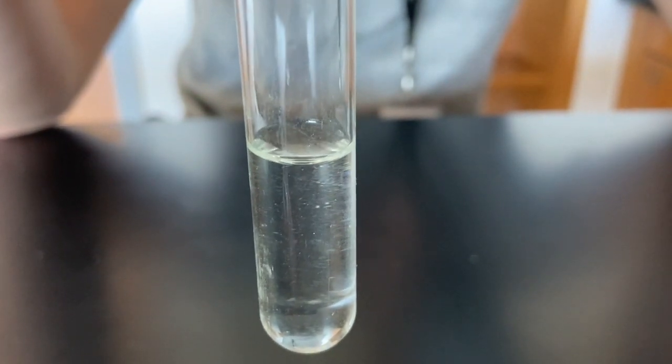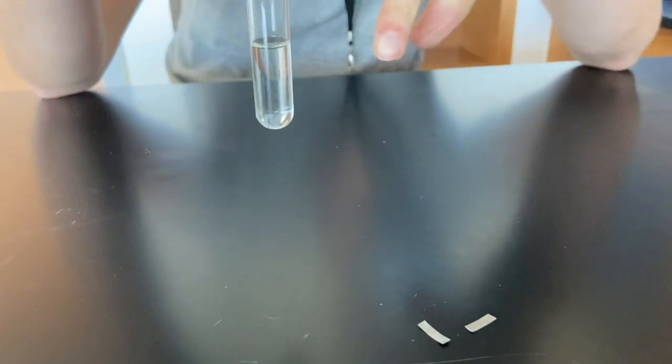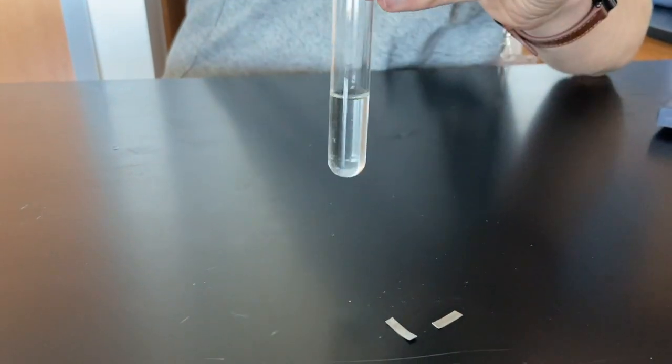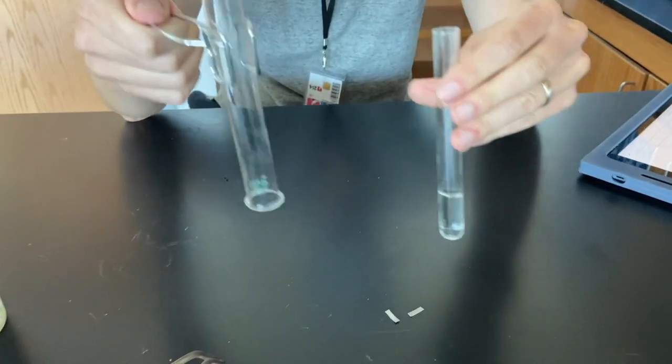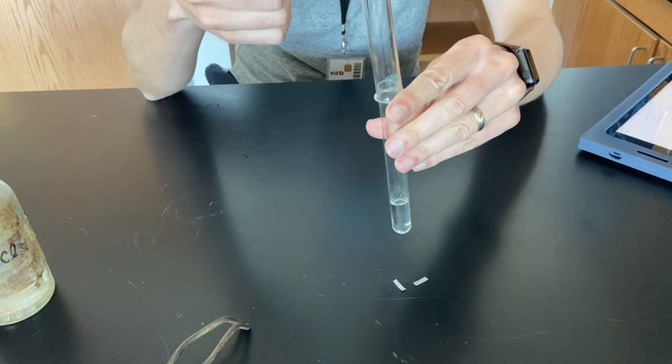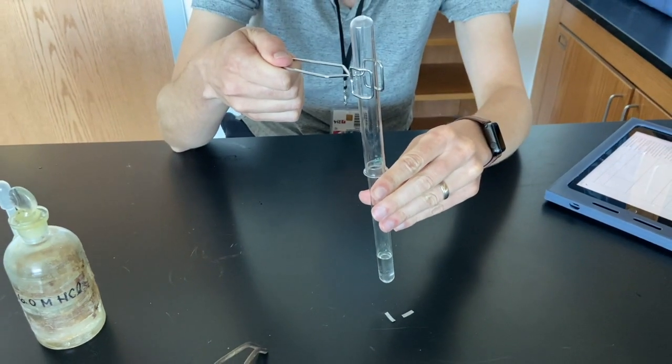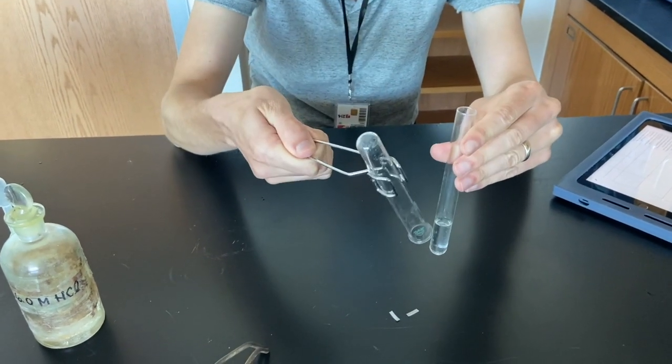Now what's going to happen is I'm going to put the magnesium ribbon, the two pieces, into the test tube. And I'm going to take a second test tube and put it over the top so I can collect the gas that's going to be emitted from this reaction.